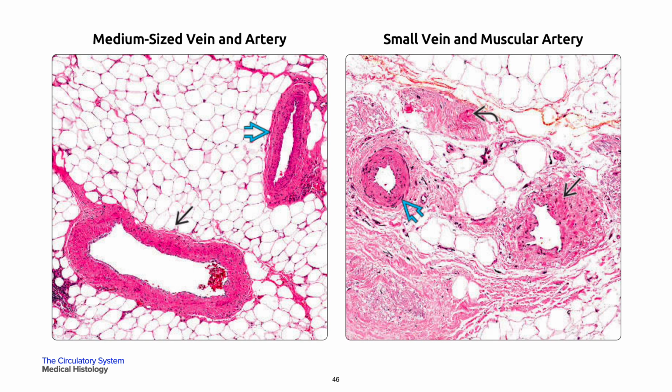On your right is this vein in a single black arrow has an irregular lumen profile and prominent longitudinal adventitial collagen bundles. An artery is next to it for comparison in bold blue arrow. The nerve is also seen in this neurovascular bundle in curved black arrow.